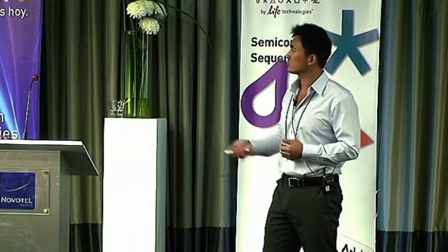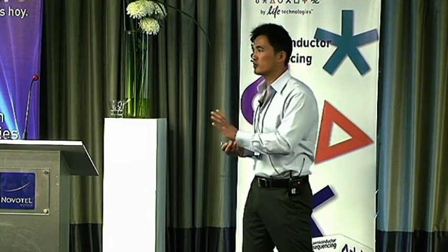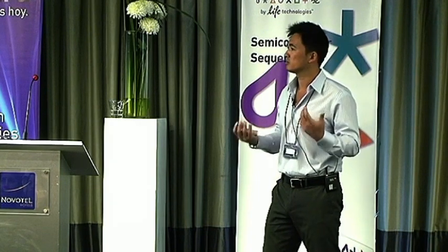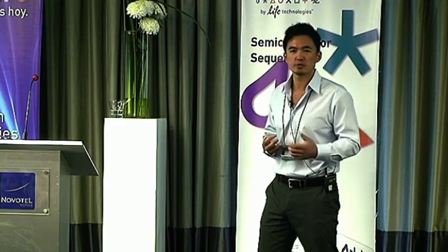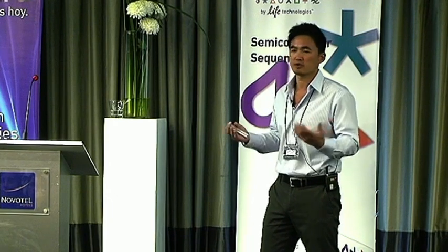So in a lot of cases, we're seeing this pop up here as well. Researchers are looking at low transcript levels, low copies of transcript, and they're getting CT values that are coming up very, very late on their traditional qPCR system. And they're not really sure what that number means. Right? So something came up at 34. Well, we tried to reproduce that, and the replicates show up at either nothing or like at 30.